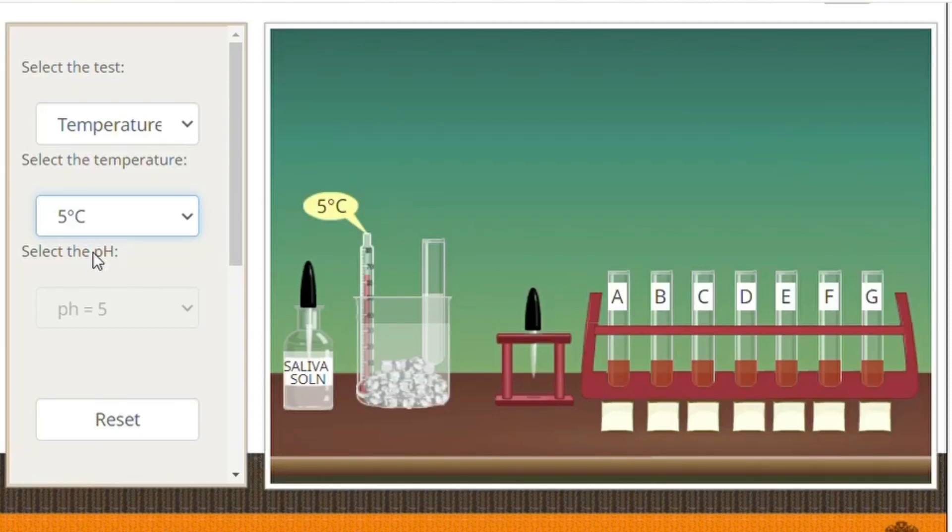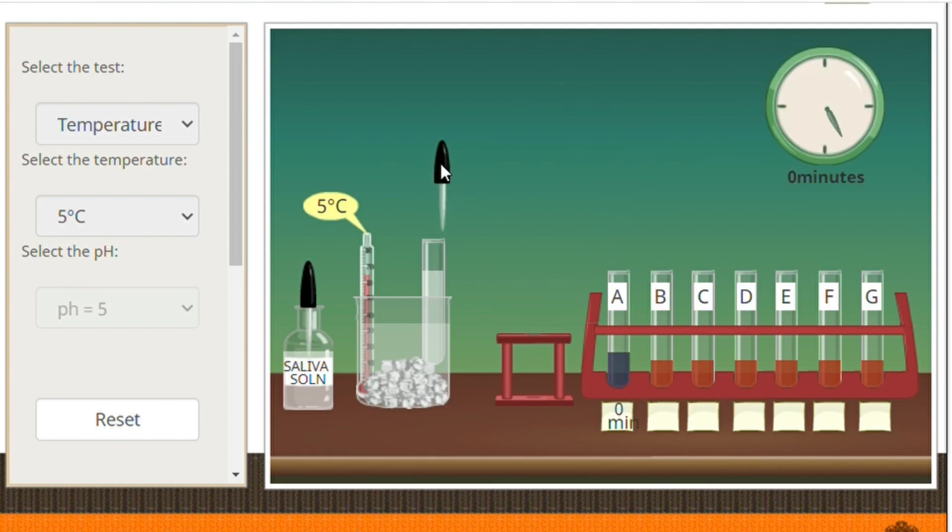In the setup, we have our saliva solution and our mixture of 1% starch solution and 1% sodium chloride solution maintained at 5 degrees Celsius, and a set of test tubes labeled A to G on the right side. First, we are going to add 1 ml of our saliva solution to our mixture of starch and sodium chloride solution. Using a clean dropper, take a few drops from this mixture and transfer to the series of test tubes having iodine solution.